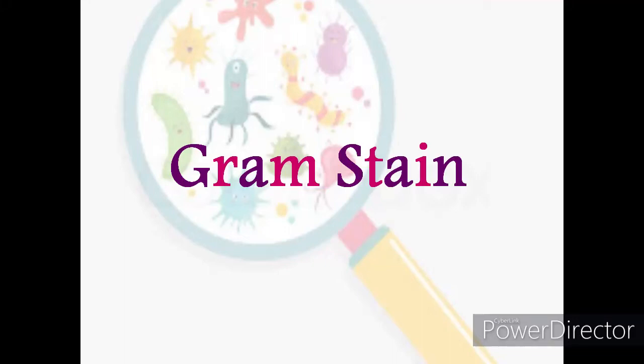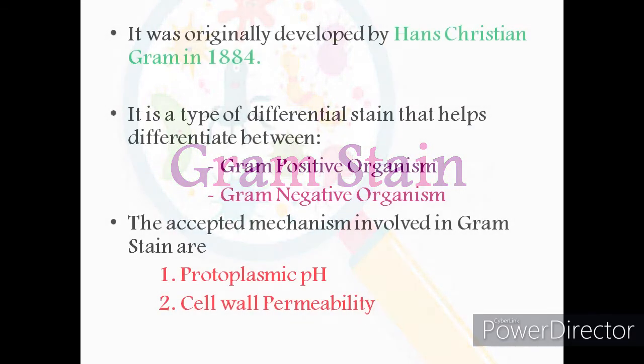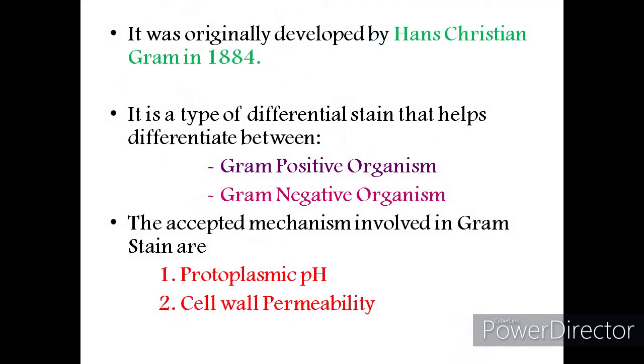Hello everyone, today we are going to learn about gram staining technique. It is an important staining technique clinically used as diagnostic material in the microbiology laboratory. Basically, staining simply means coloring the microorganisms or a cell structure so that it helps in learning about the microparticles.